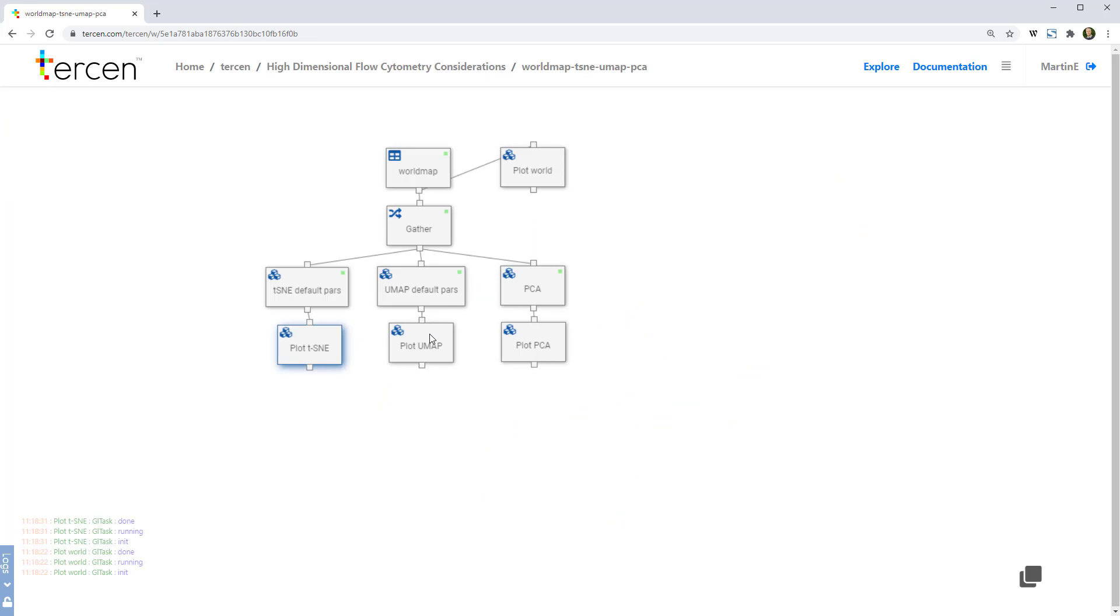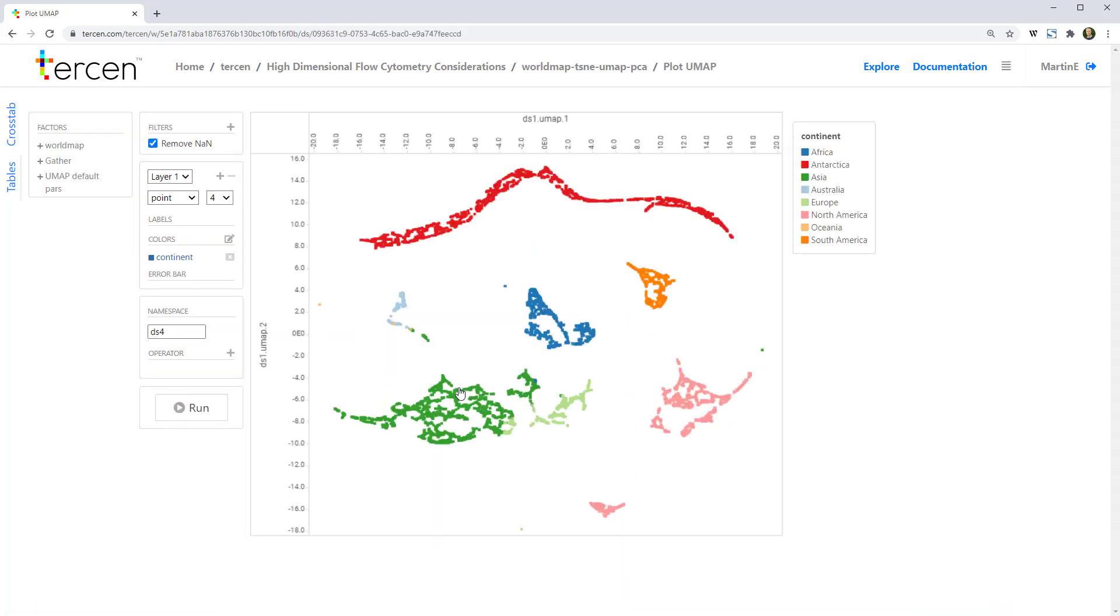UMAP, on the other hand, maintains the local structure of the data, at least as well as t-SNE does, but performs much better at maintaining the global structure. Despite being flipped upside down, you can see that continents are all recognizably closer to their real positions relative to each other.